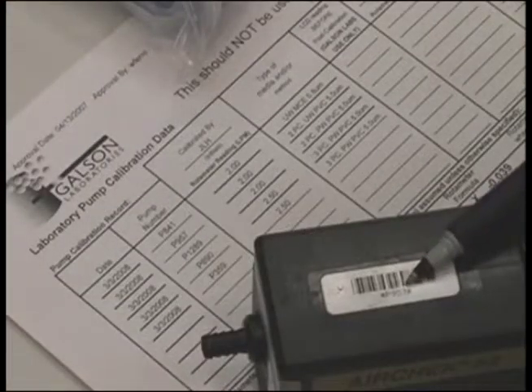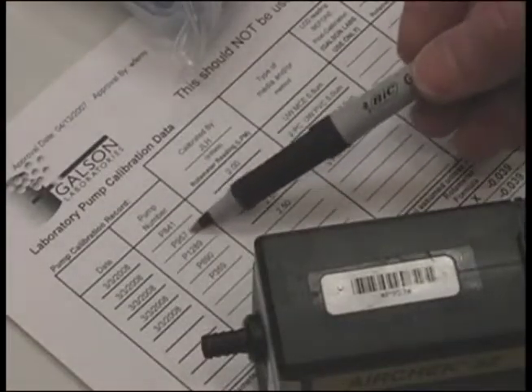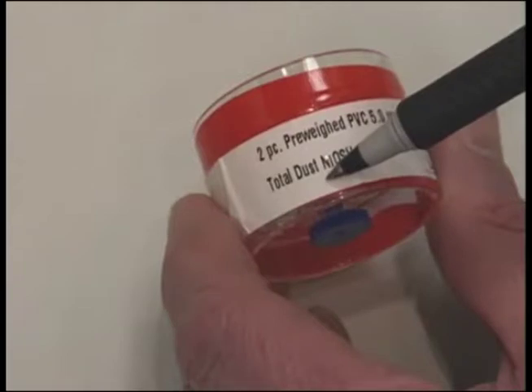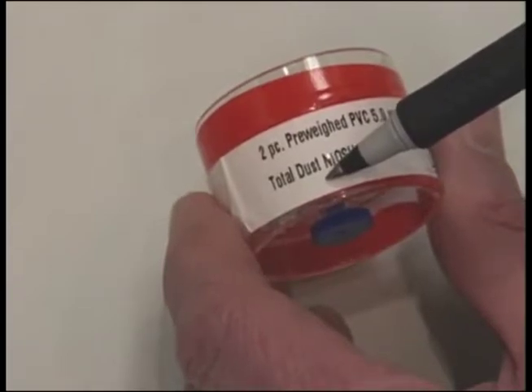All pumps will have a label with the flow rate and type of media to be used. The media will be labeled as to what it is used for, so verify that you know what filters are to be used for what method.